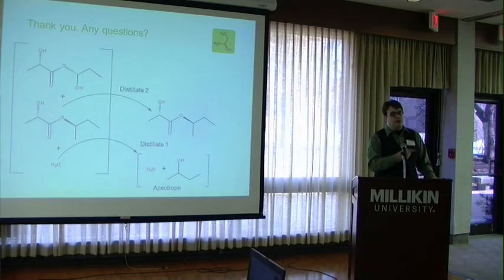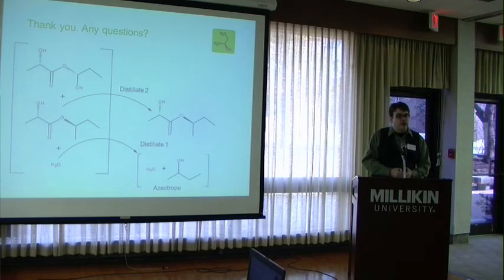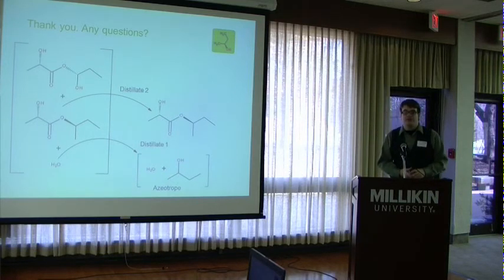And then we're going to repeat that process with the other alcohols in order to separate them and hope that we can draw conclusions off proper data that way. So, good question. Thank you. Anybody else?